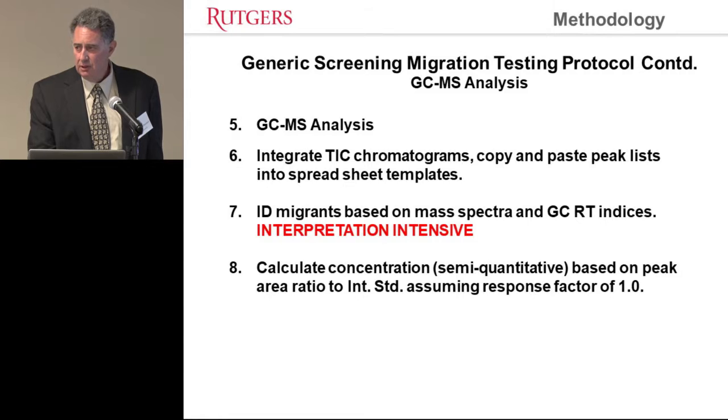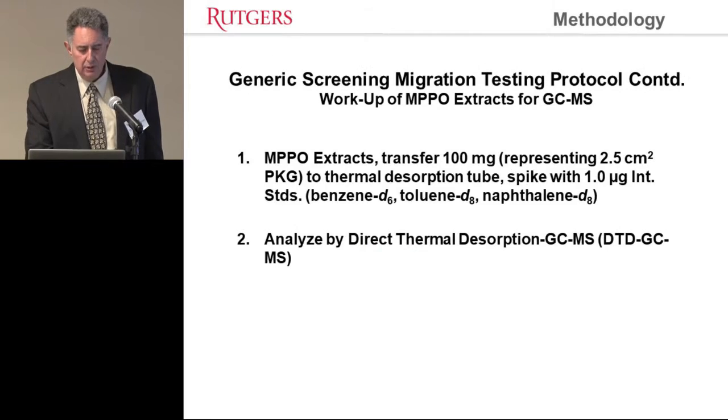When I first started mass spec in the 70s, we used the slide rule. We basically had an oscillograph recorder, no computer, that used UV paper, etching the spectrum out, and we had to take a slide rule to make the spectrum and plot it as a graph, manually, believe it or not.